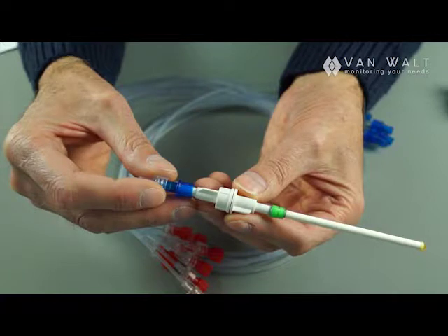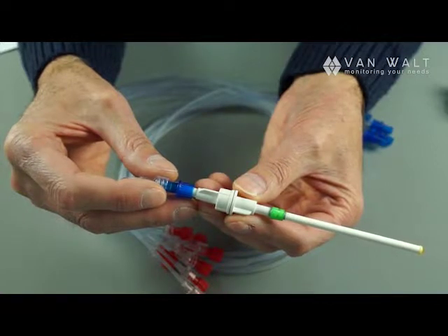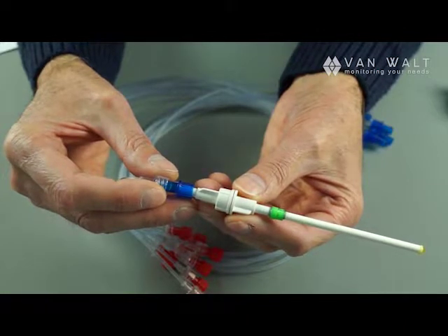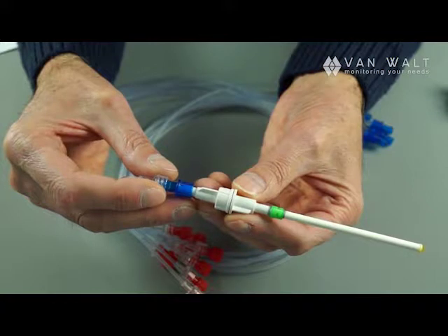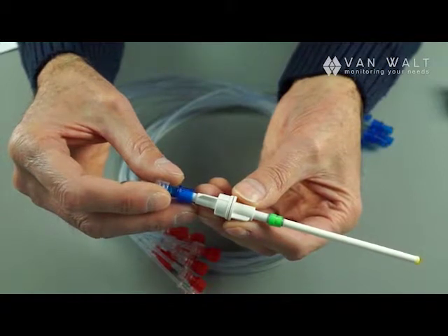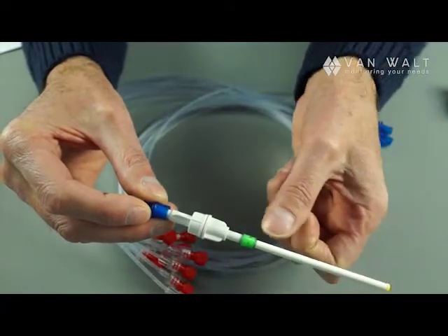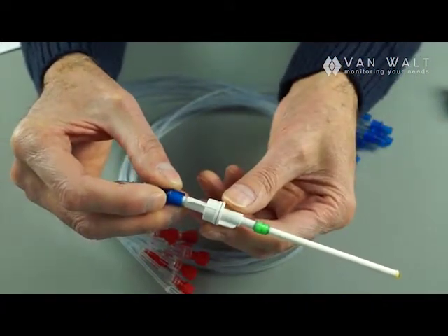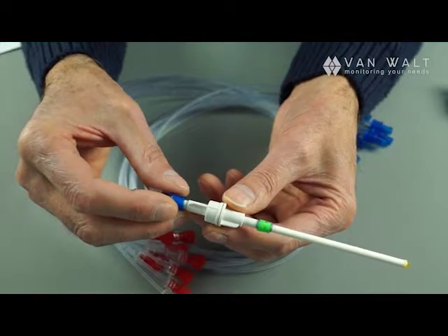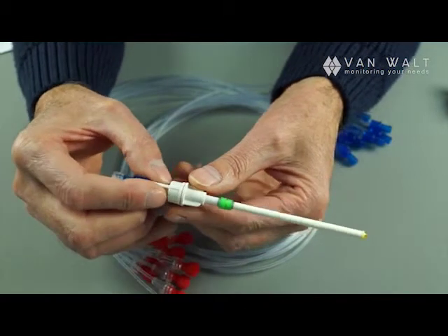If you are measuring soil solution, the rhizome gives you many advantages. It is an inert material, it gives quick and clean samples, and they are relatively easy to insert. Just a few warnings: they are not frost resistant, so if you are working in shallow layers the polymer will freeze, or the water inside the polymer will freeze, and you could risk that they crack. So if it is going to freeze you either have to remove them or you run the risk that the cells burst.